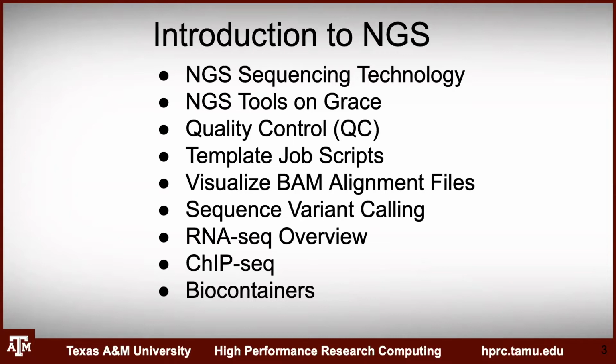We'll also be looking at template job scripts. These are scripts that are available for Grace users to run computationally intensive jobs on the Grace compute nodes. So if you say you want to map some reads to a particular genome, there are scripts available to help you accomplish that through our job submission process on the cluster.